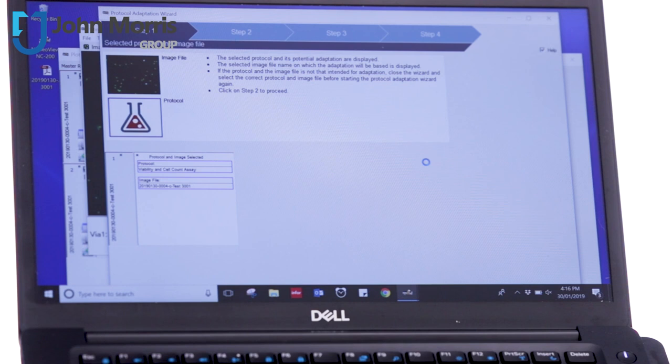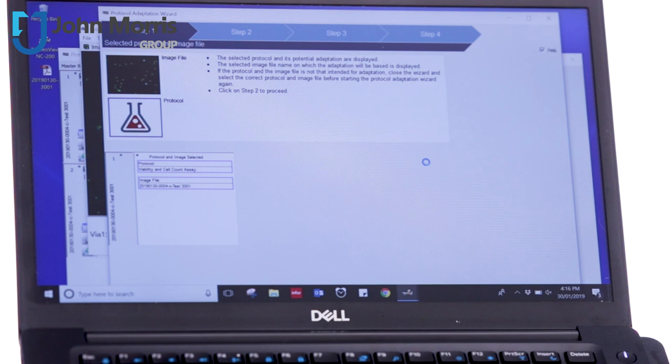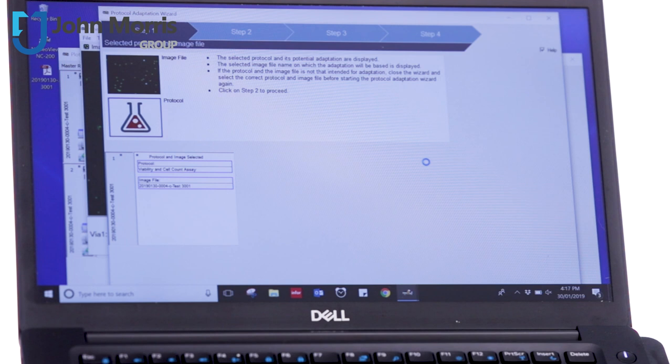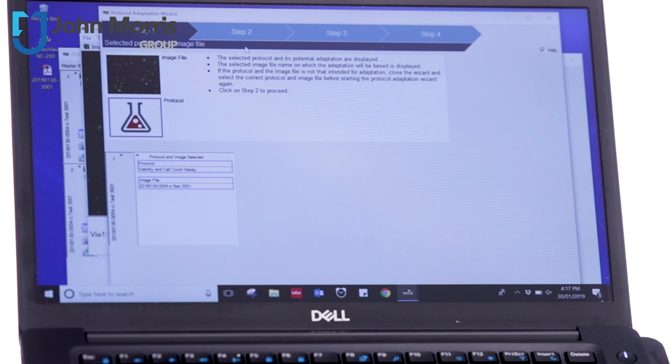That will stay exactly where you want them throughout all of the processes. So you never have to worry about doing this manually each time. It's set and forget, and it will remember it from then forwards.